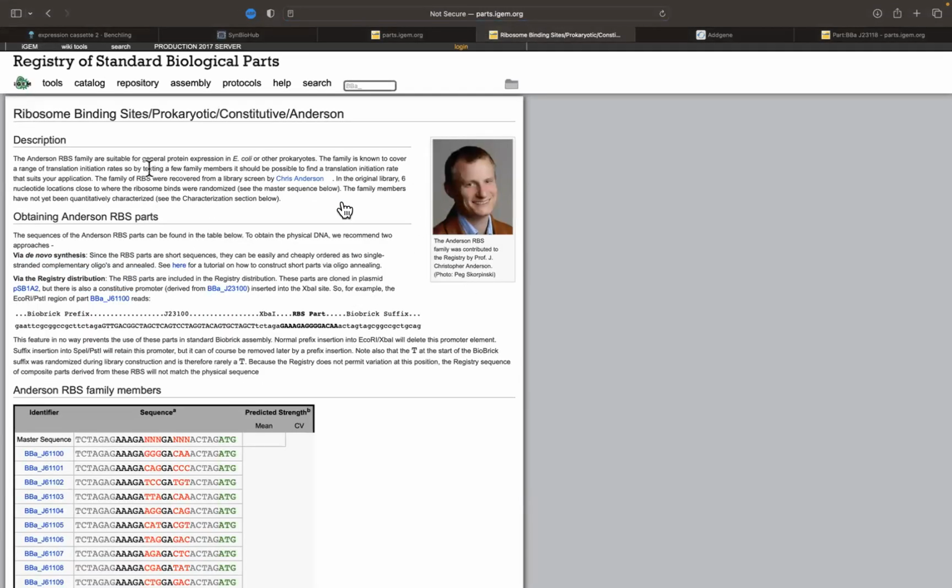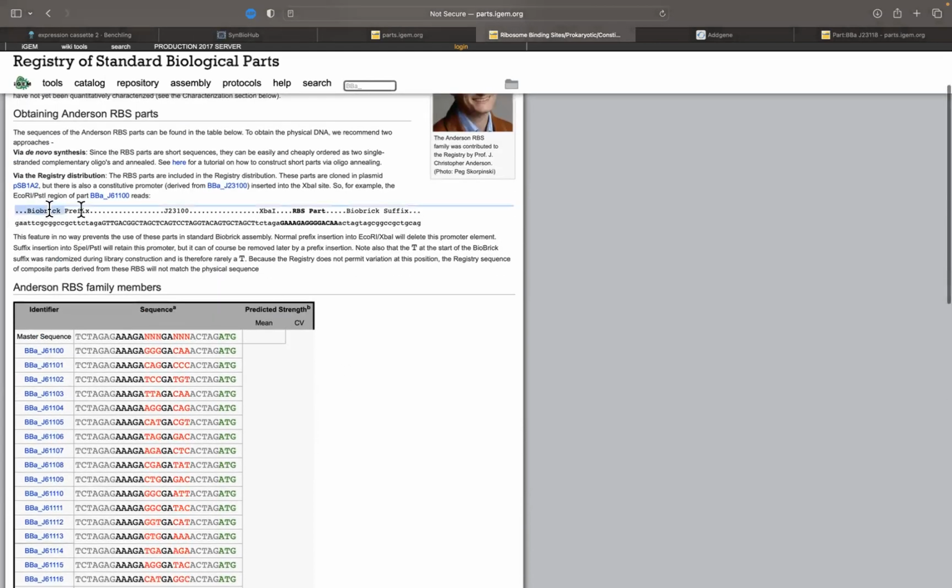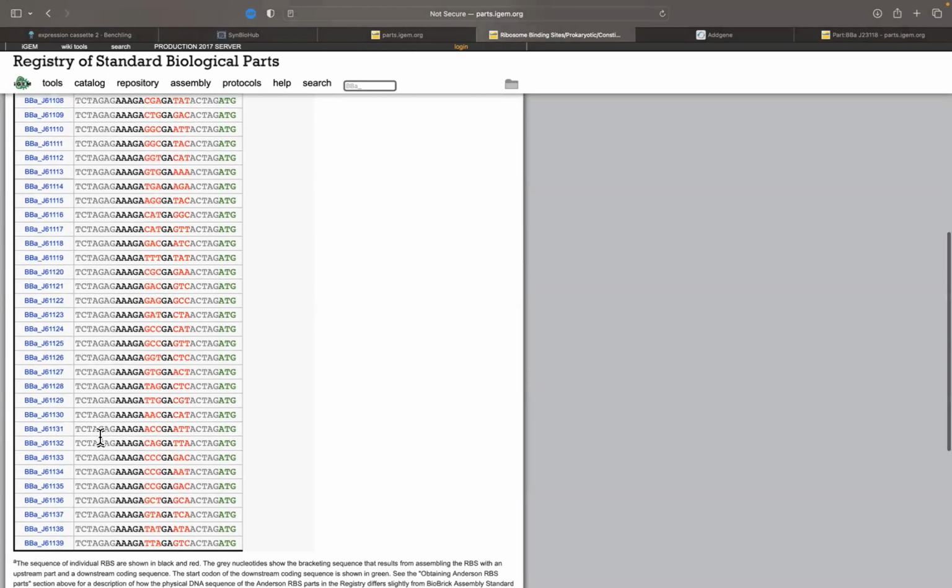Okay. This is the description, what's inside, what's not. This is how the structure of the biobrick is made. There is the biobrick prefix that has the enzymes inside. There's an XbaI enzyme in between, and as a part, they are usually sold and sent by iGEM with the promoter J23100, which I've been seeing is the same family as the promoter we chose. But in this case, we're not interested in this one. So we go through them and look at what we decide to do.